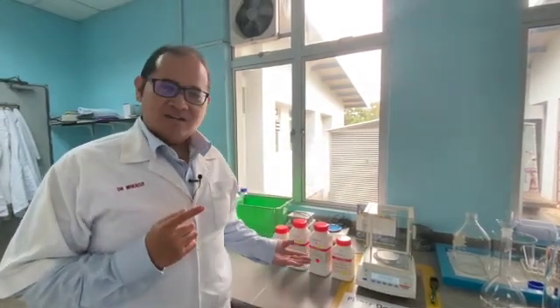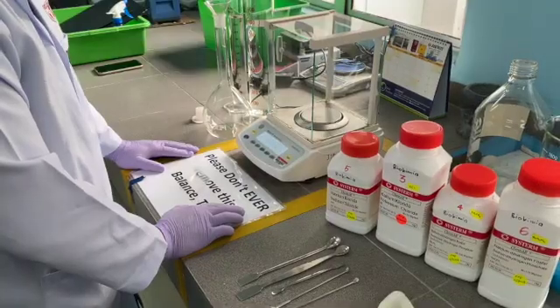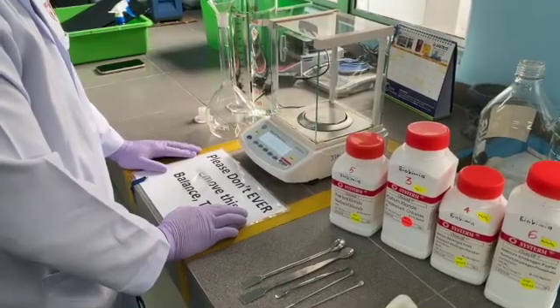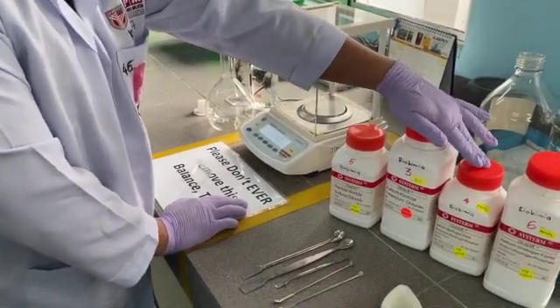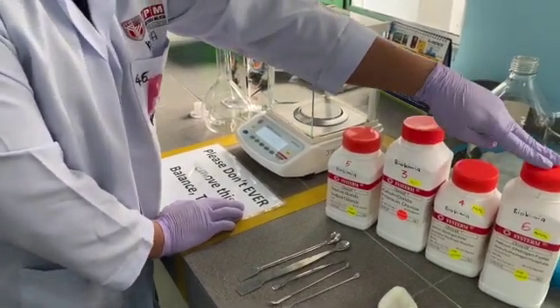Today, we will prepare a 1X phosphate buffer solution. To prepare, we will need sodium chloride, potassium chloride, potassium dihydrogen phosphate, and sodium dihydrogen phosphate.